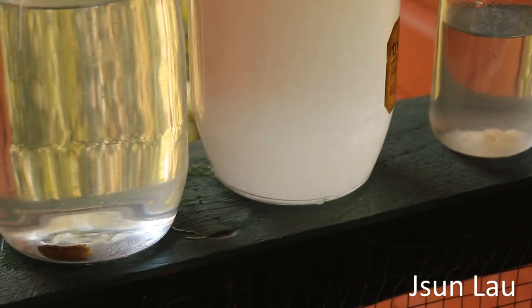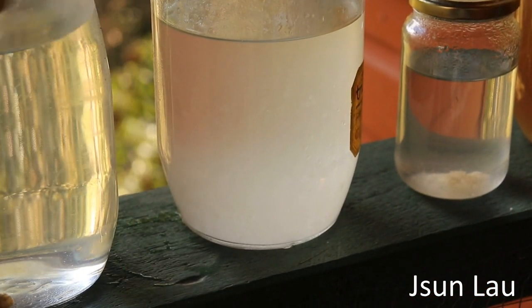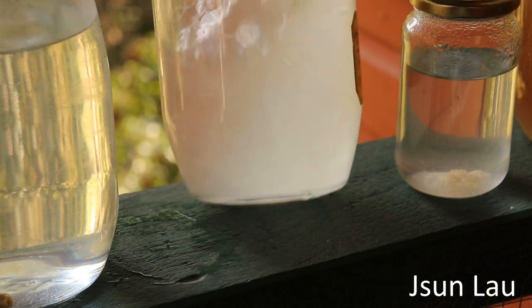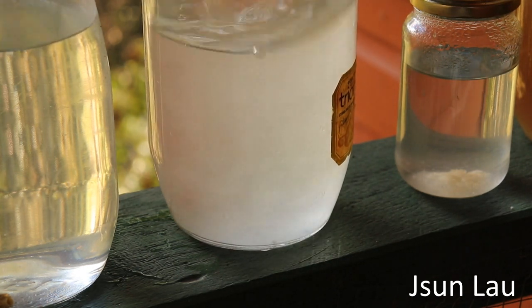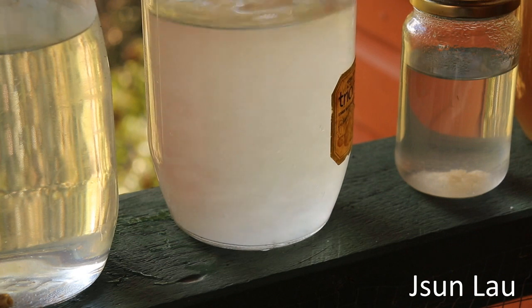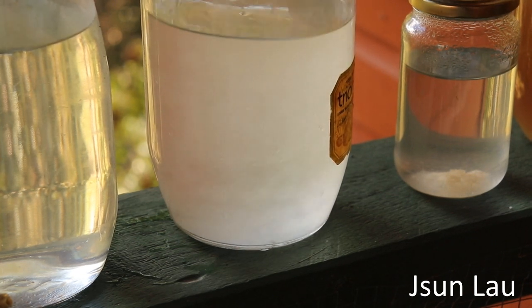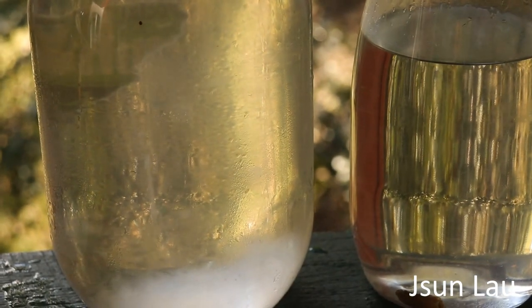The one next to it is quite cloudy. This one must be about a month old, so that's all the mycelium. Give it a shake, and from that jar I transfer to some other jars.